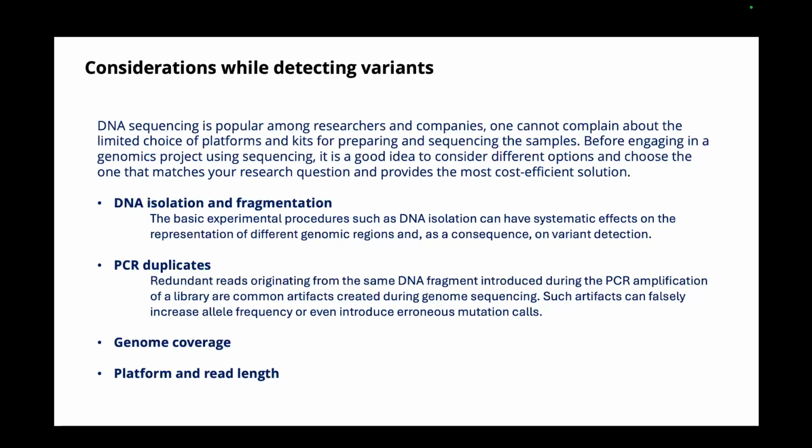So before engaging in a project using sequencing, it is always a good idea to consider different options and choose the one that matches your research question and provides the most cost-effective solution. Take DNA isolation and fragmentation, depending on your type of sample. Say, for example, you know that a particular sample is a diseased sample, and you have an idea that a particular gene has been affected, and around this gene you are expecting some sort of mutation, some sort of variations in the gene.